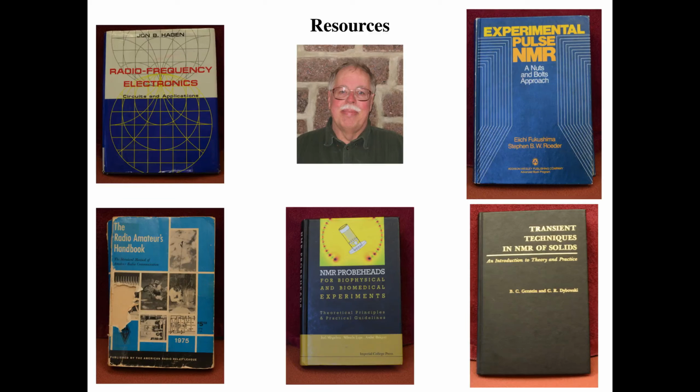Some of the books that we find particularly helpful include the book by Fukushima and Roeder, Experimental Pulse NMR, and the Radio Amateur's Handbook. Both of these books have many helpful ideas and hints on making RF circuits that are relevant to nuclear magnetic resonance. NMR books oftentimes have chapters devoted to NMR hardware. For example, the book by Gerstein and Dybowski has a chapter dedicated to NMR spectroscopy hardware.